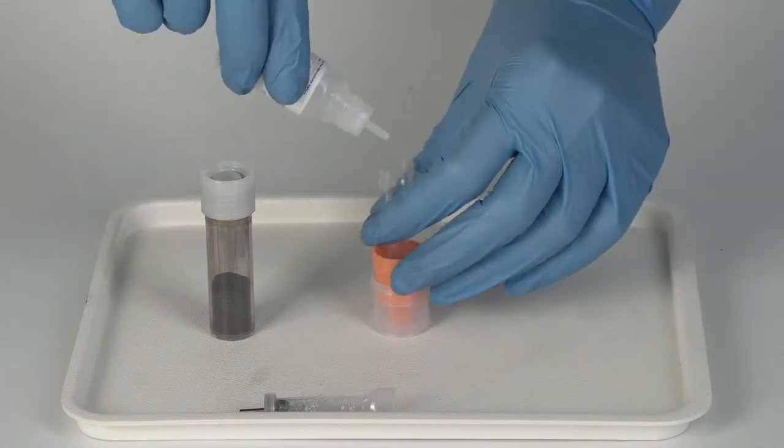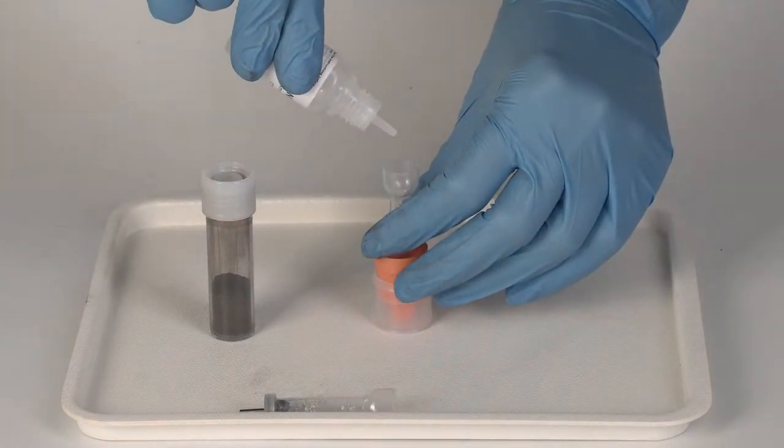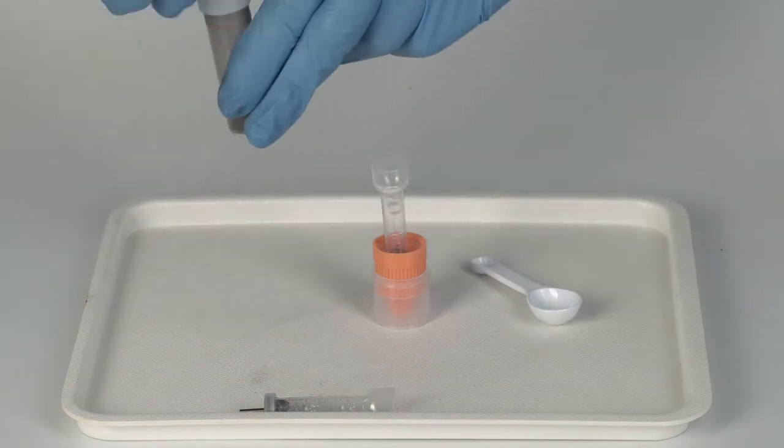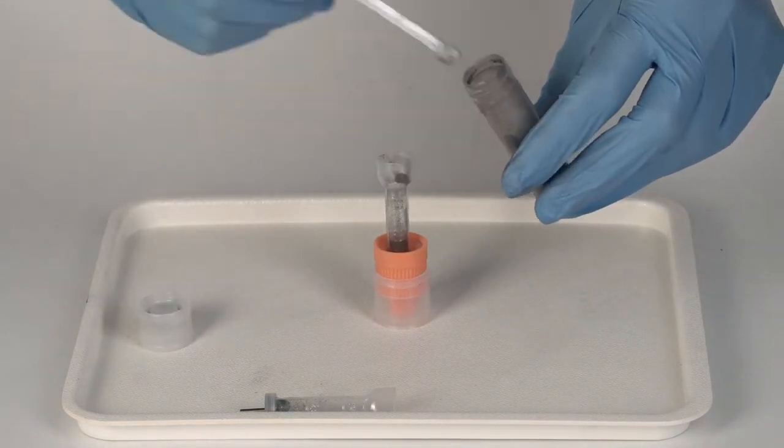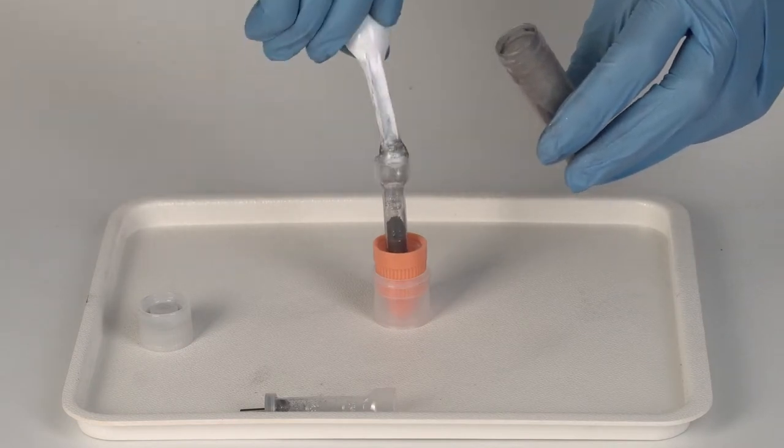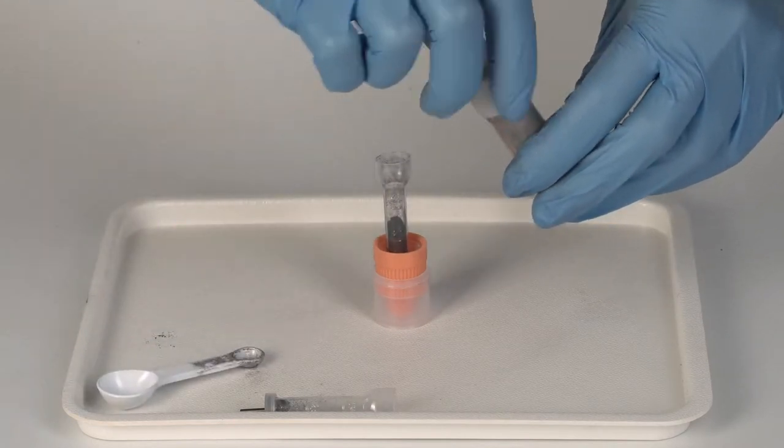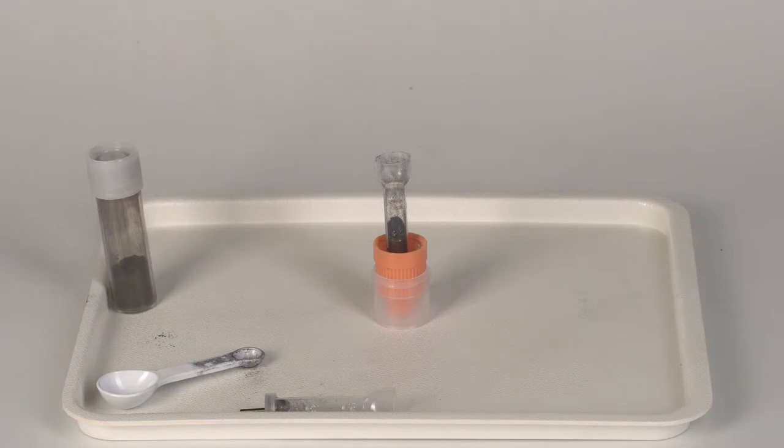Now add 10 drops of ammonium chloride to the plastic tube. Then add two small measuring spoons of the mixture you prepared before. Close the vial and save the rest of the mixture to make the second battery and to repeat the experiment.